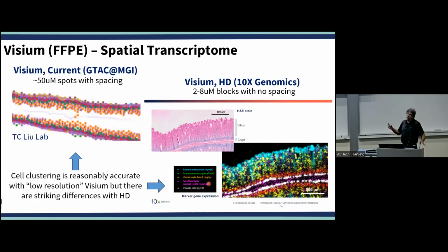Now, you say, what's the difference between the current Visium and the Visium HD? Well, up here, you're going to see a really big difference. Over on the left, the spots are 55 microns specifically. I've really blown this up, but you can see that this is mouse ileum. Where you see these orange and green dots, you'll see maybe about 2 to 3 dots total. Those are the individual villi, or villus structures, in the ileum.